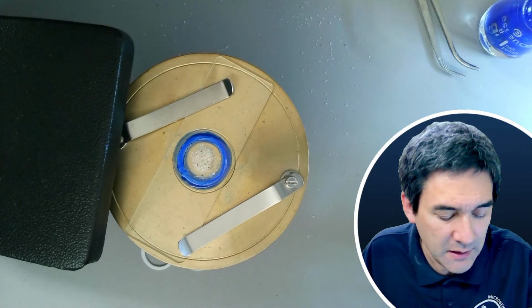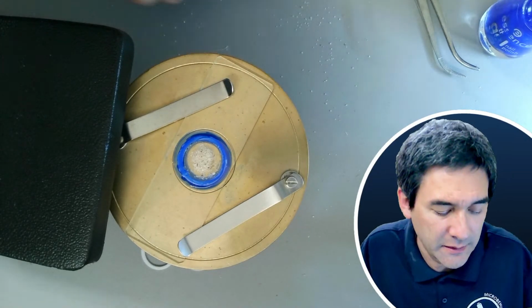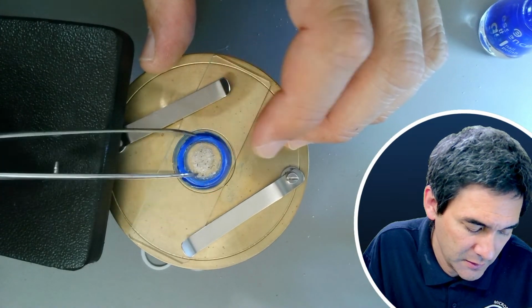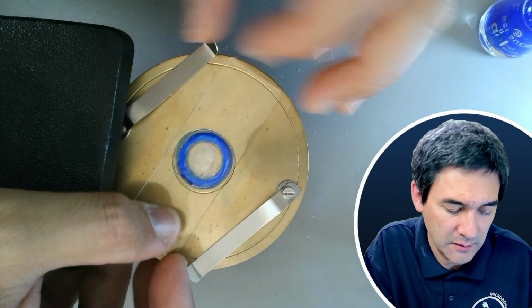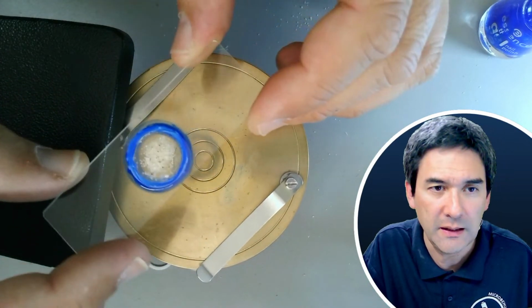So this means that it might be necessary to add more nail polish later on. So nail polish really shrinks quite a bit. I'm just going to leave it as that, and I shouldn't forget to add a label later on.